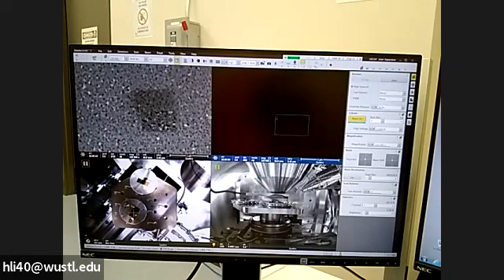Okay, this focus is just stigmatism. Make the image sharp, and we check the wobbling. It's a little bit off. So, yeah, left and right, you just move left and right. So you move the tag, it depends on how the image shape is.